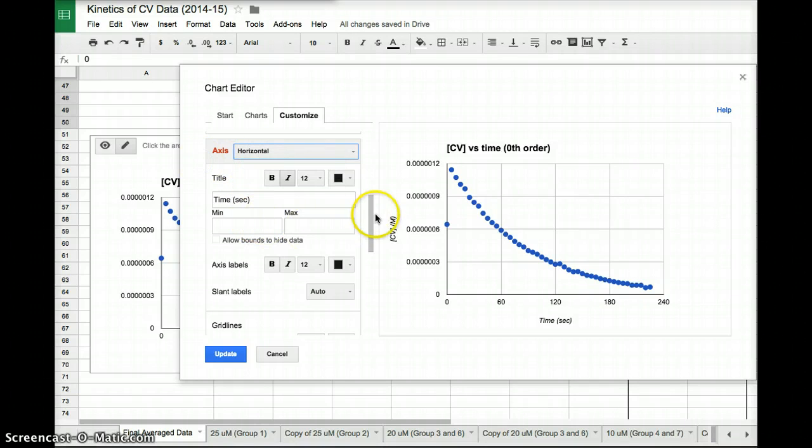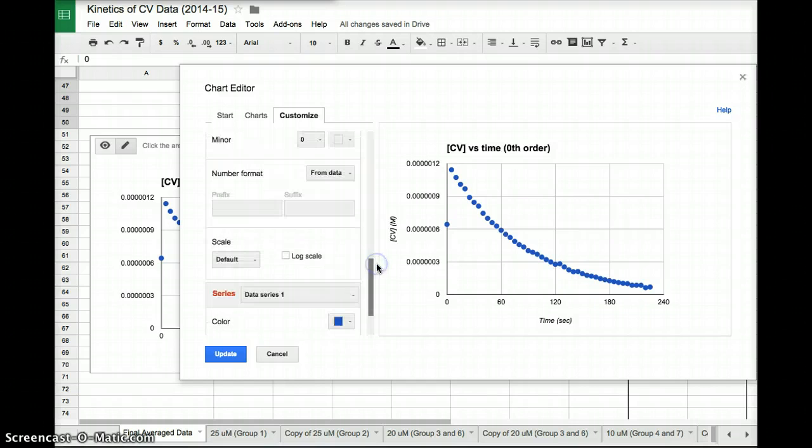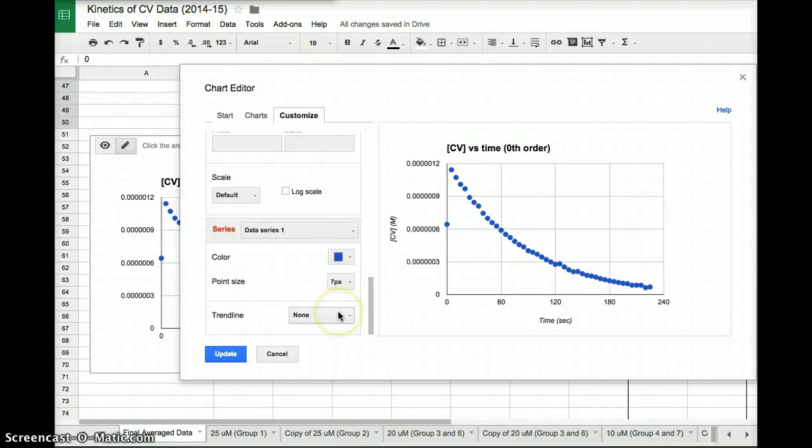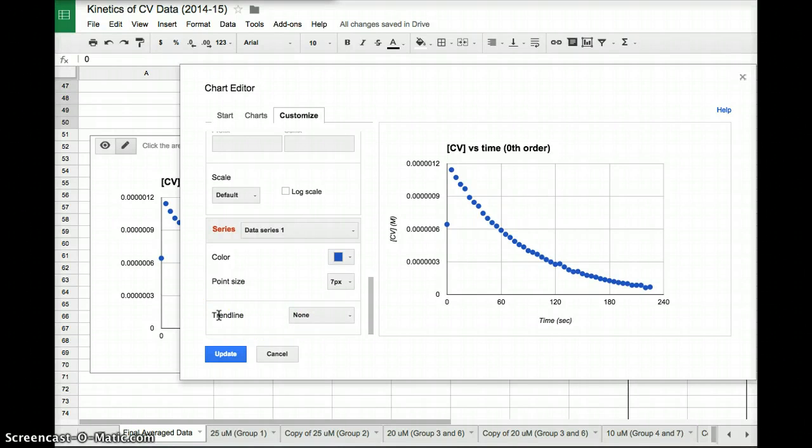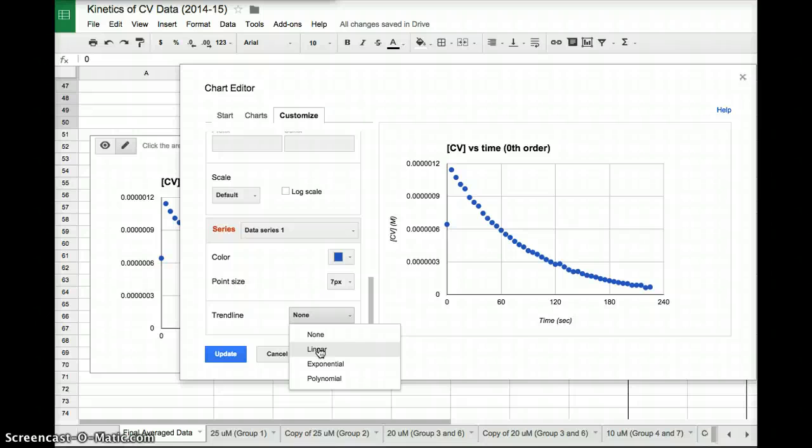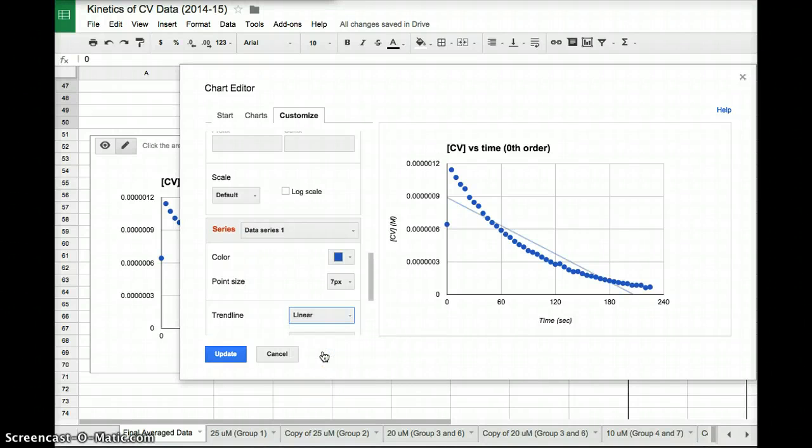And then the next thing we want to do is we want to figure out how accurate is this data. So in order to do that, we want to plot a trend line. Remember, we want to look for the function that's going to be the most linear. So for the trend line, I'm going to down here, what this is going to do for me is draw a best fit line. So the options, I want linear. I want something that is in a straight line. I don't want an exponential function or a polynomial. So I'm going to click linear.